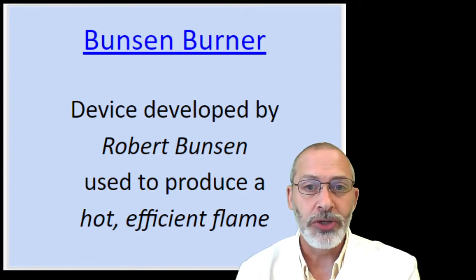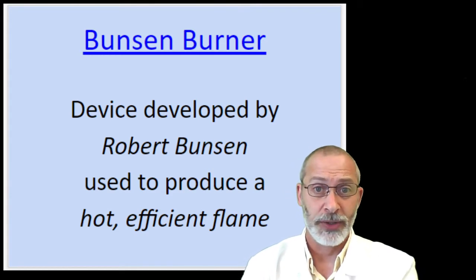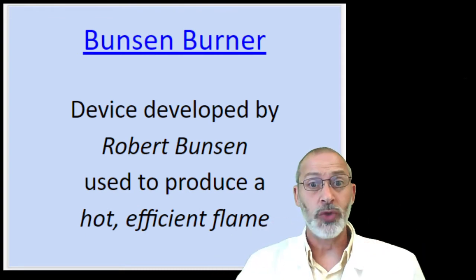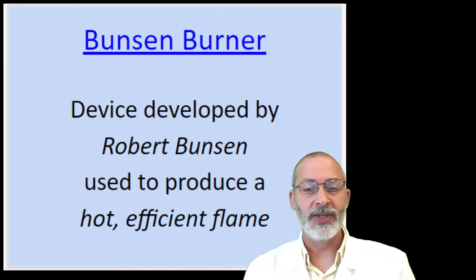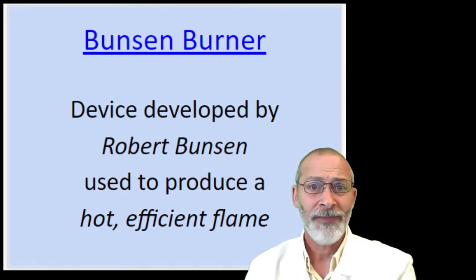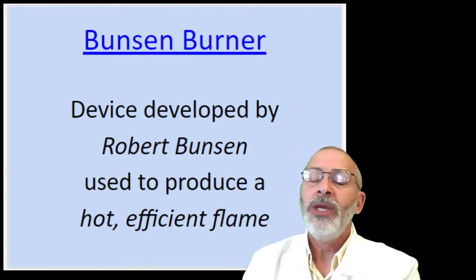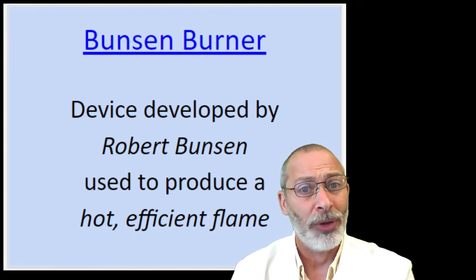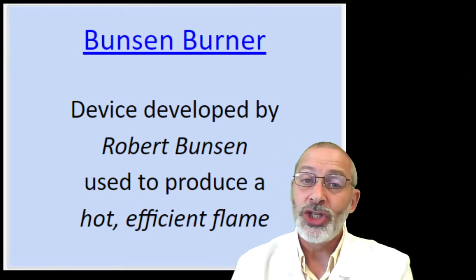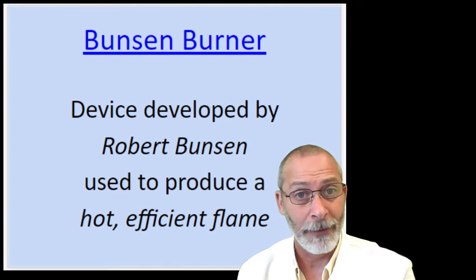In the days and years prior to Robert Bunsen's invention of the Bunsen burner, scientists would often do experiments where they had to use heat energy to heat things up using candle flames or little alcohol lamps. And these flames, although hot and certainly hot enough to burn you, were not capable of producing flames hot enough to facilitate certain chemical reactions.